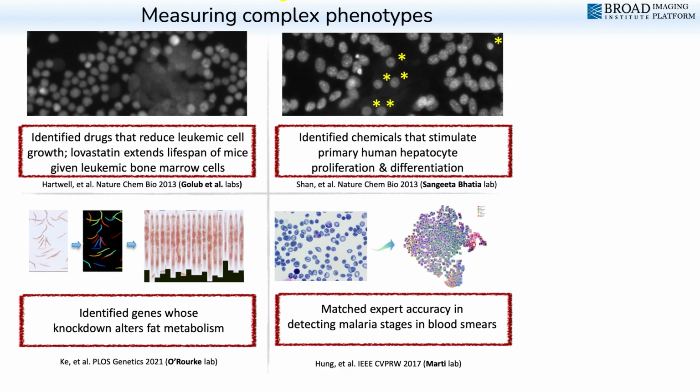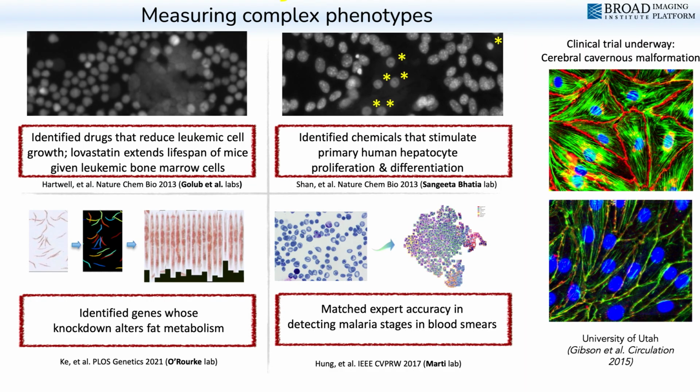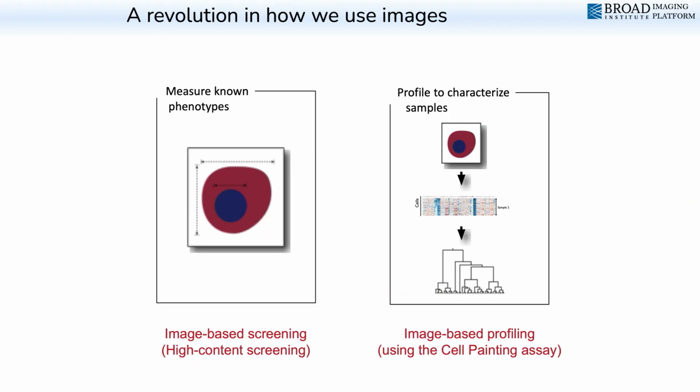And then, again, this machine learning-based approach of creating a classifier to find a phenotype has also been very powerful, a lot of impact here too. And this is just one example where a company called Recursion used this idea very early on in their formation to go and find potential drugs for a cure of a rare disease. So sorry for just running through this. I wish we could talk about individual cases, but I think it's nice to keep this at the high level so that we can transition into what I consider to be the next frontier, right?